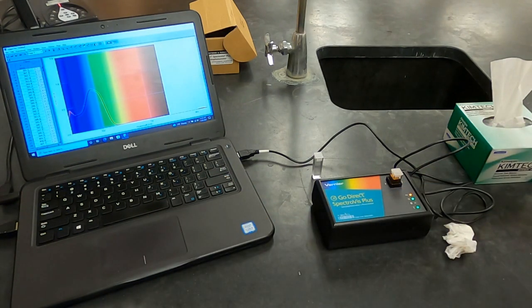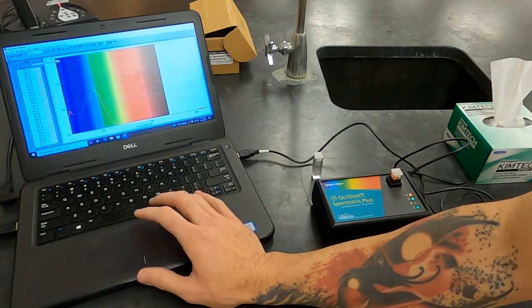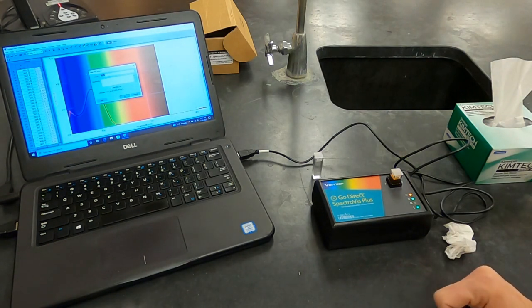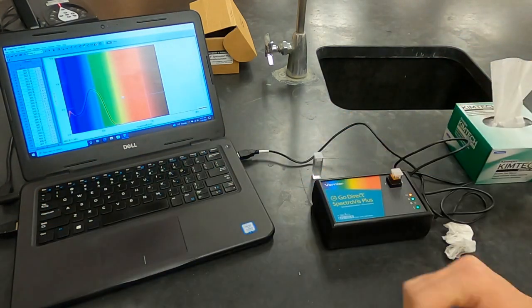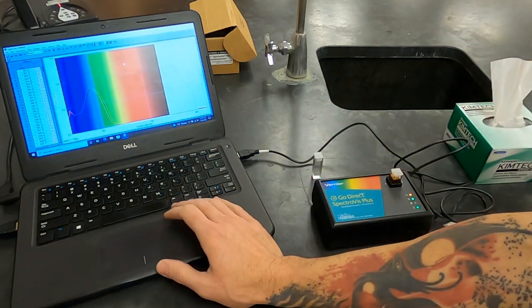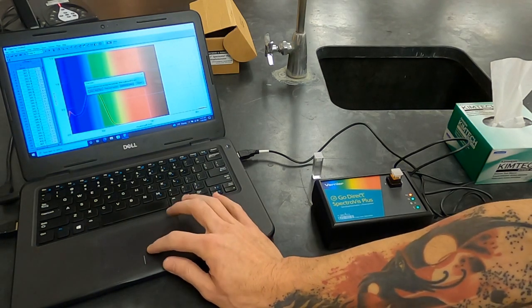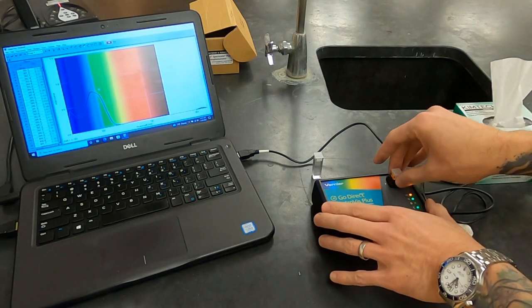Now at this point, to get ready to do the next one in line, which is for me, green three, though it doesn't matter what order you do them in, I'm going to double click on latest. And I'm going to call this data set what dye it was, yellow six, so that I can keep track of them. Now, the next time I hit collect, it's going to start another data set and it's going to save this yellow six. I want to store my latest run and then switch cuvettes.